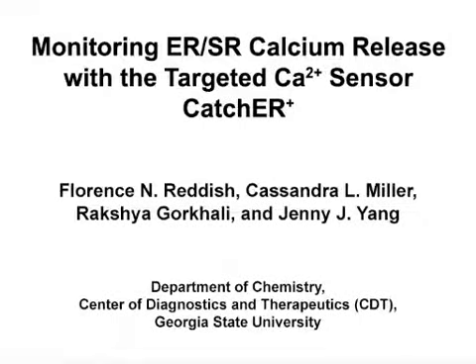The overall goal of this experiment is to display our protocols for the culture and transfection of HEK293 and C2C12 cells with CatchER Plus and its application for monitoring ER/SR receptor-mediated calcium transients and the measurement of the in situ KD.